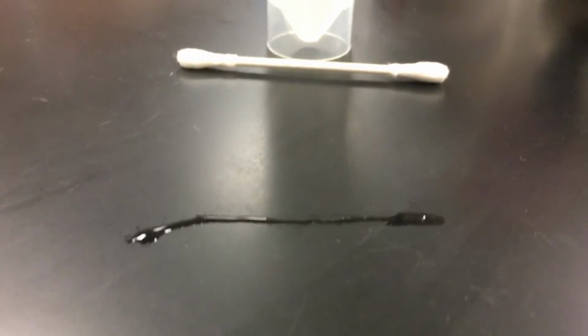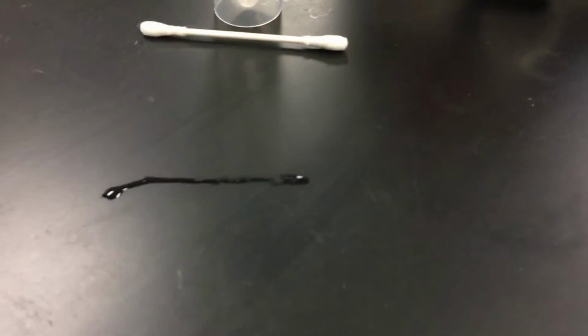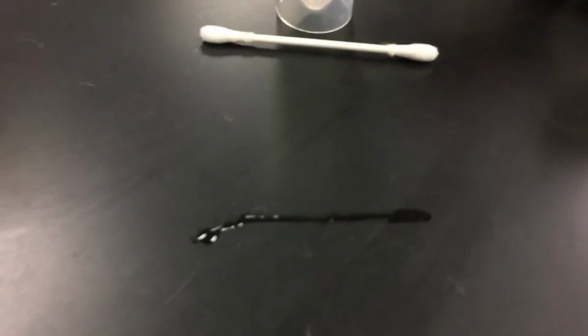Okay, you'll be able to notice this holds to itself better. It bubbles up rather than laying flat. So this is what we call surface tension, where the molecules hold together so well, you get a surface that holds up against whatever it's laying across. It doesn't just splay out flat against the table. We don't have as big of a bubble here compared to what we have here. Water has some very good surface tension as well, and it has to do with hydrogen bonding.